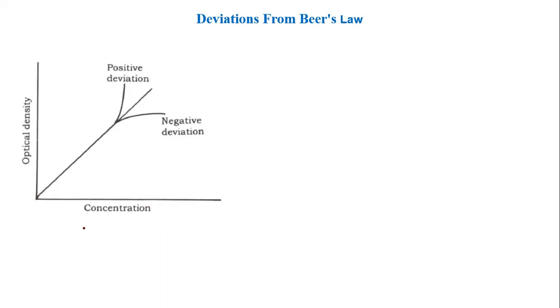That means, for example, for proteins, you start from somewhere around 0.2 microgram concentration, and you go to maximum around 1 microgram concentration. Okay. And then you prepare a standard curve and you plot the OD values and you get a straight line passing through origin. That is what is expected. But there is something that is pretty more interesting here.